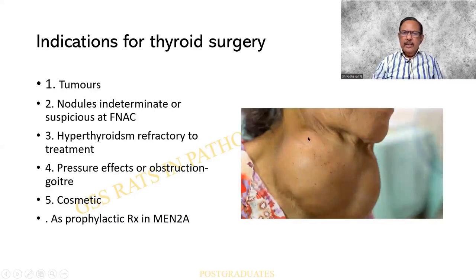And this, incidentally, obviously, far exceeds the 50 grams that I have mentioned, but the lobulation or bosselation can be well made out. The pressure effects are self-explanatory.